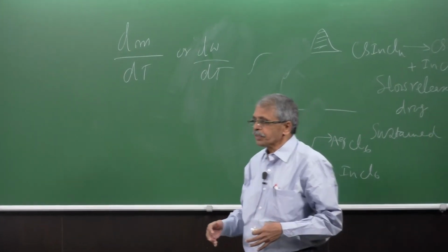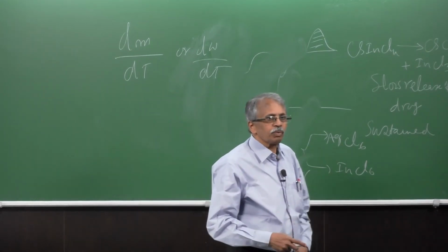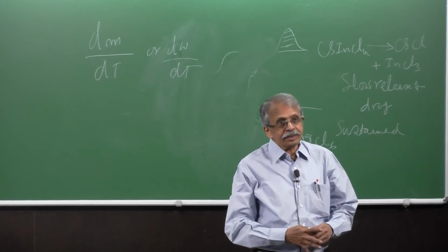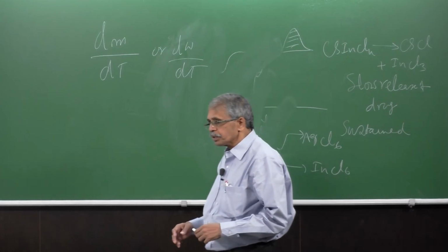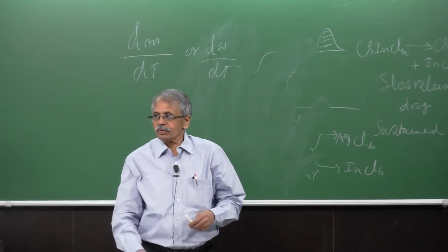If there are any impurities, you can find that out as well, to what extent, what percentage. In most applications people look at how much impurity the polymer has. They may not be so bothered about what kind of impurity. They are bothered at that stage only when some other unwanted property comes into the picture, or your main property gets diminished. In that case people look for what those impurities are.